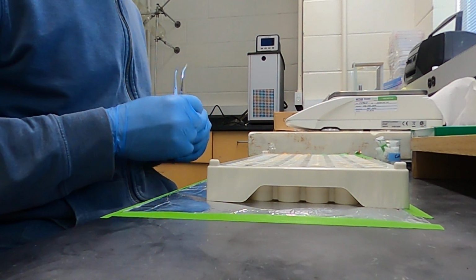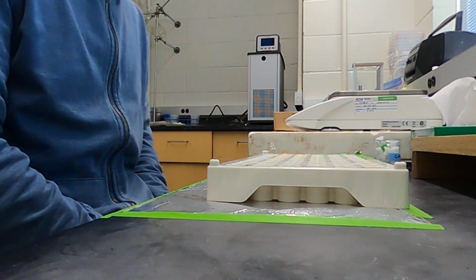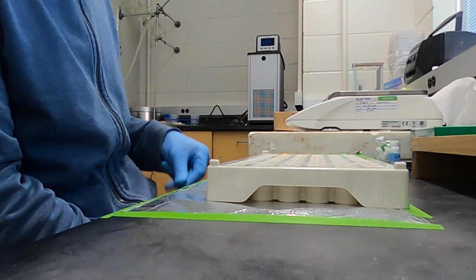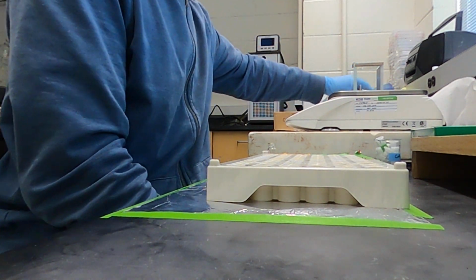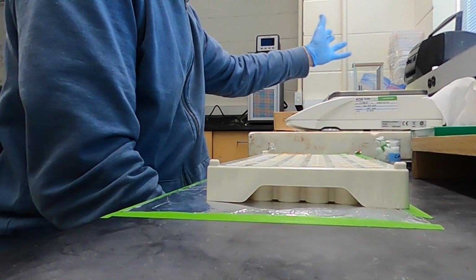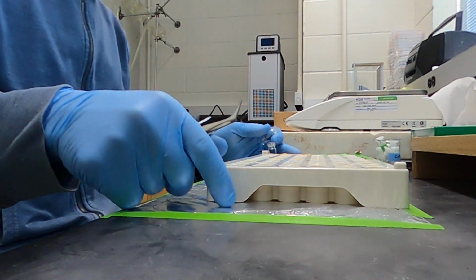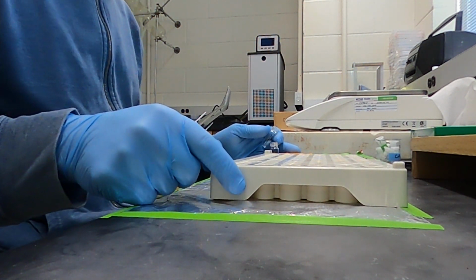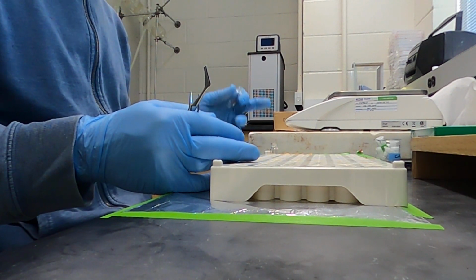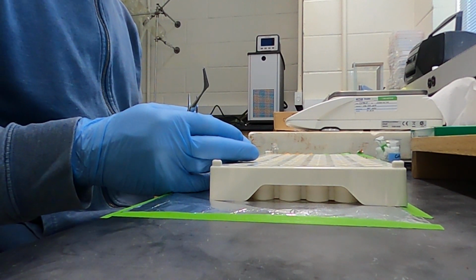So the customer told me that in every vial they sent me, there was about 90 micrograms of ostracod shells. So it's roughly, and there might be some impurities, but according to what they told me, it's not significant. So we say there's 90 micrograms of carbonates. So the idea here is to measure the exact same weight for all the standards. That is, every vial I'm gonna place here, I'm gonna weigh 90 micrograms of NBS 19, 90 micrograms of NBS 18, and 90 micrograms of TASOS.